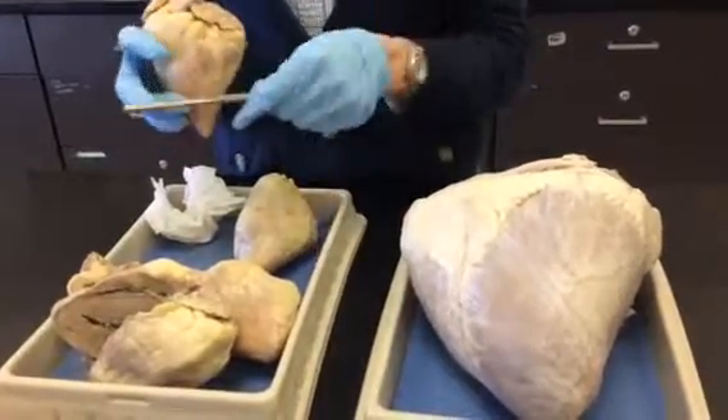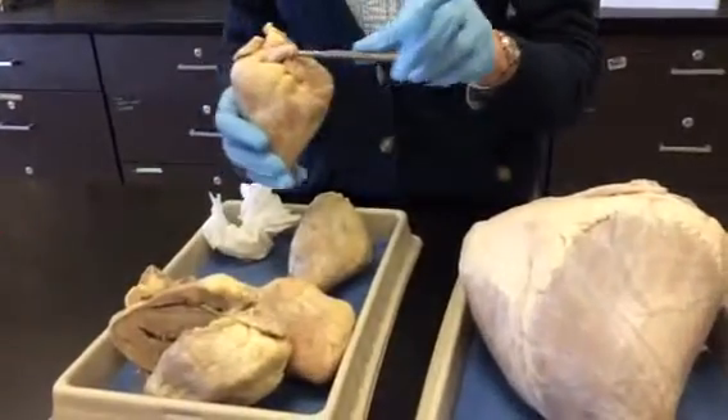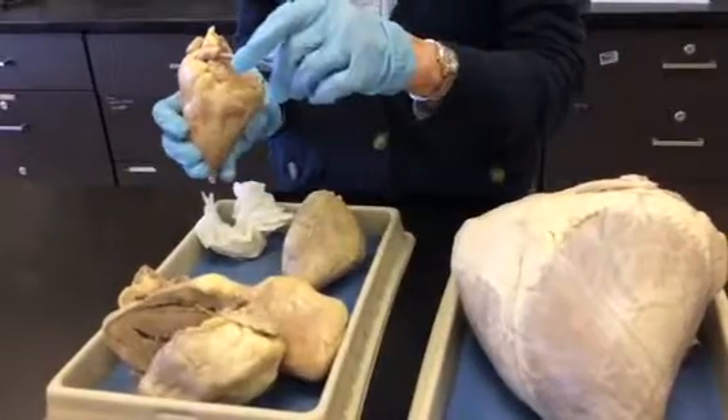Look at some of the other external features here. This vessel that lays sort of flat across the top of the front of the heart — that's the pulmonary artery, going out to the lungs.